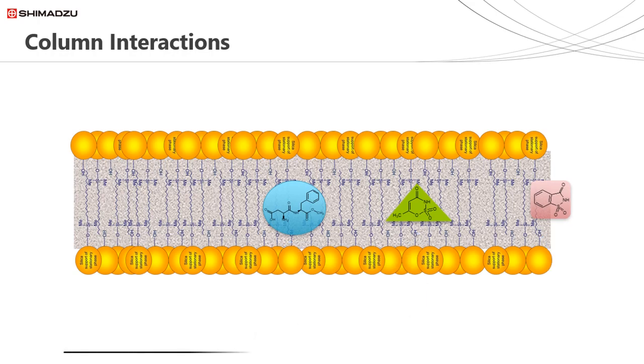The chromatogram for this separation may look something similar to this, with the elution order of red, green and blue having the longest retention time. All mixtures are separated into their individual analytes by HPLC depending on their interactions with both the stationary and mobile phases.